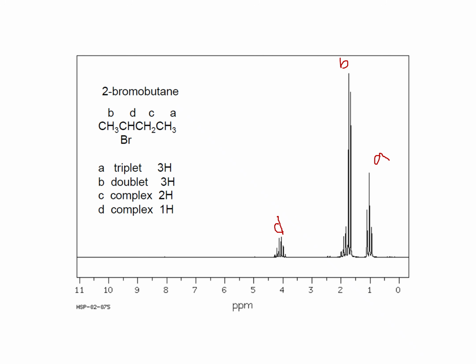There would be D, and this is C, this is C. Sometimes some of the peaks integrate with one another.